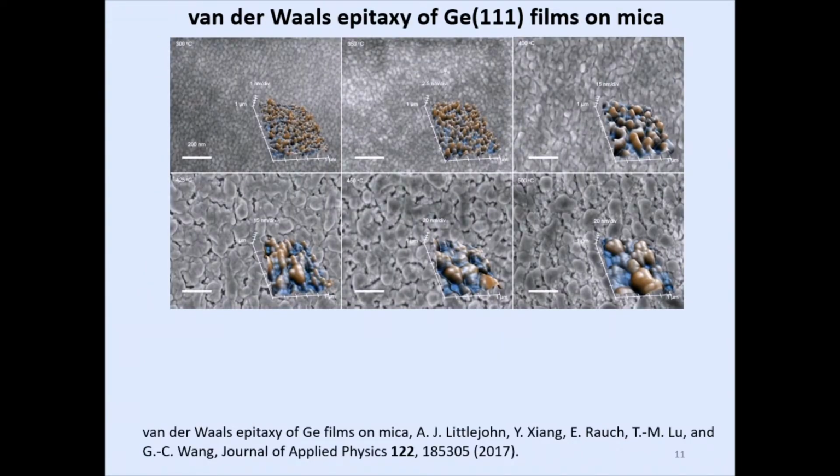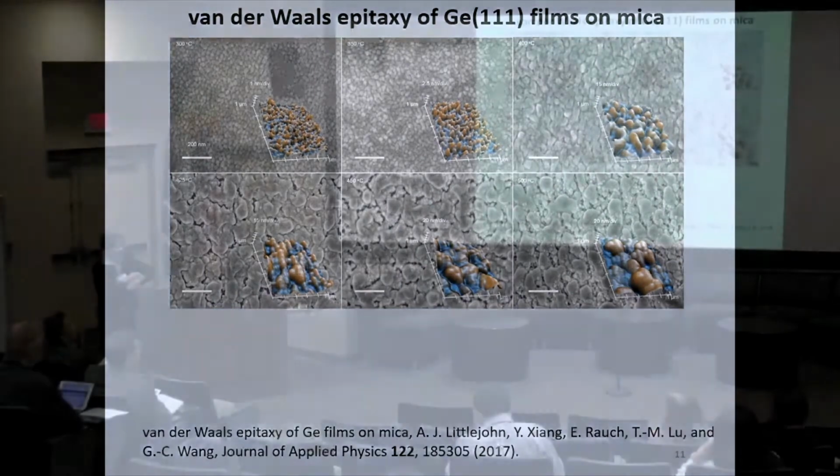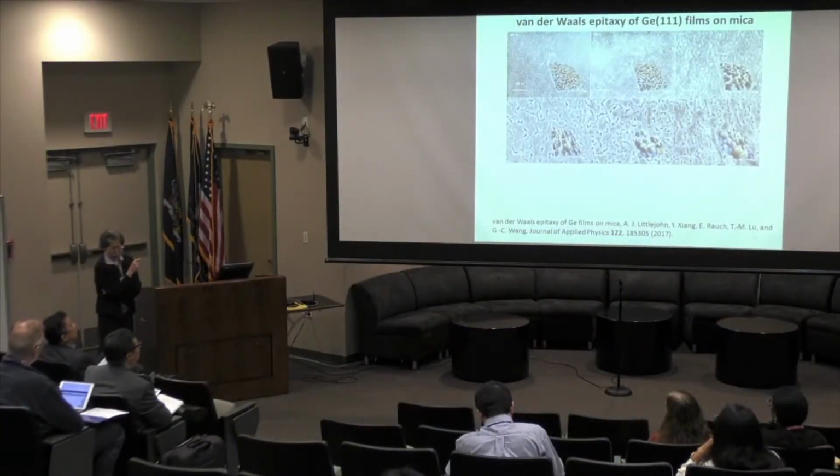Actually, my original abstract has only those two topics. But I think that this is an AFM conference, and I have listened to many, many nice talks. The major parameter to describe a rough surface is the RMS, as we have seen in the past 2 talks.